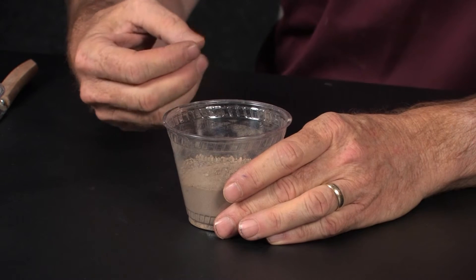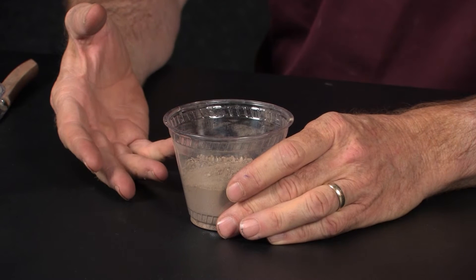I'd like to talk to you about salinity — that is the presence of salts in soils. There are a lot of different ways that soils can be tested for salinity, and I'm going to review those with you today. The method that we can get the best knowledge out of readily is called a saturated paste.